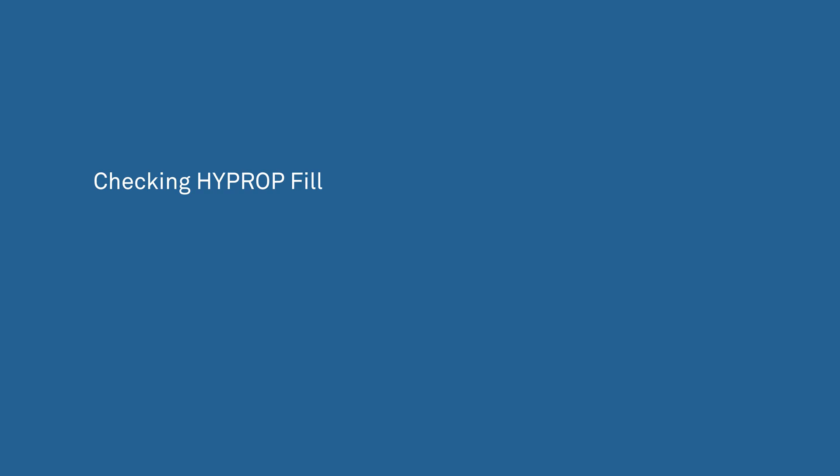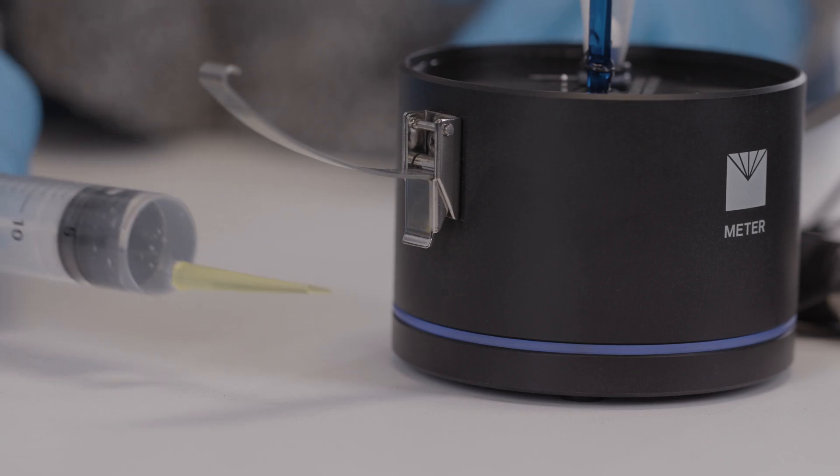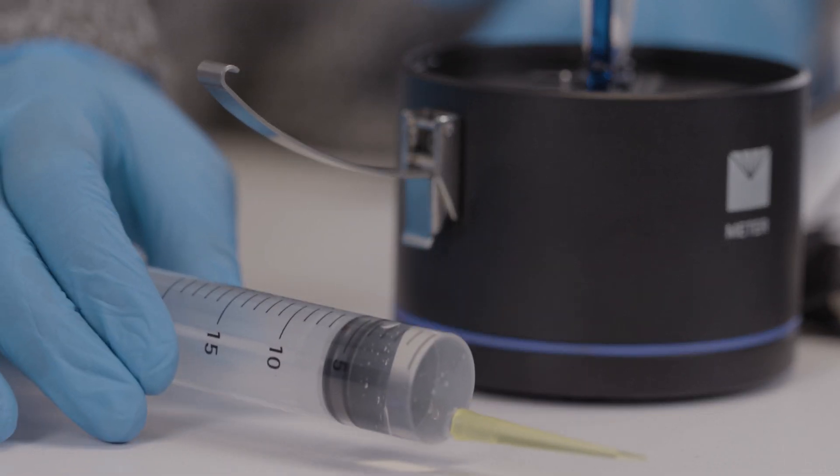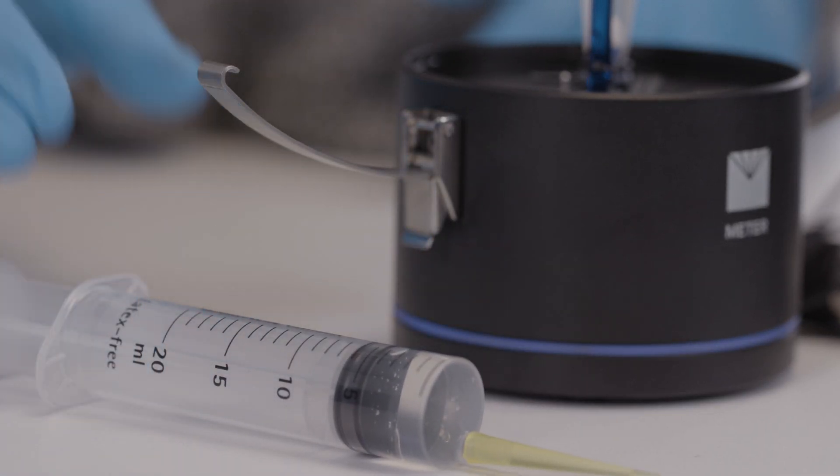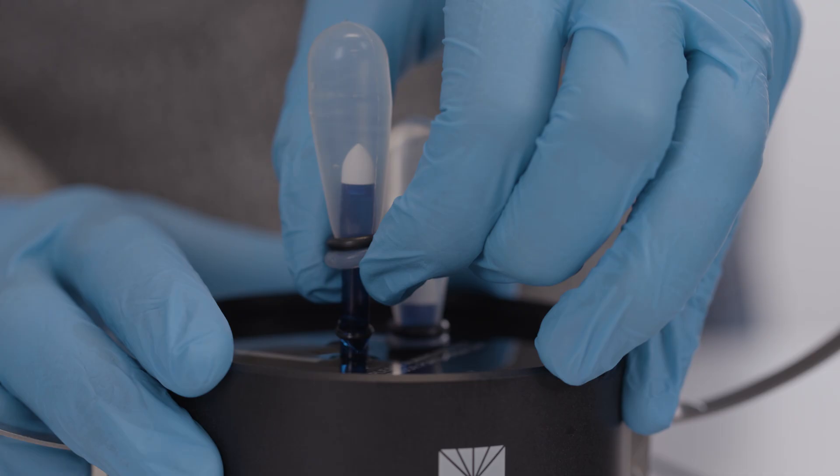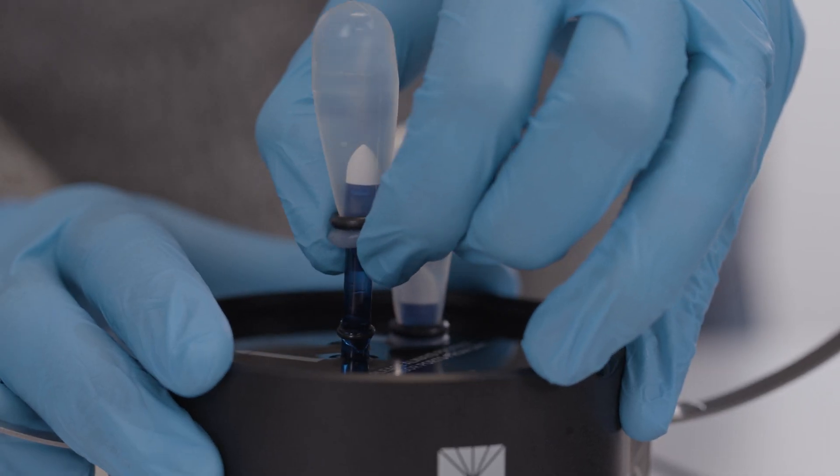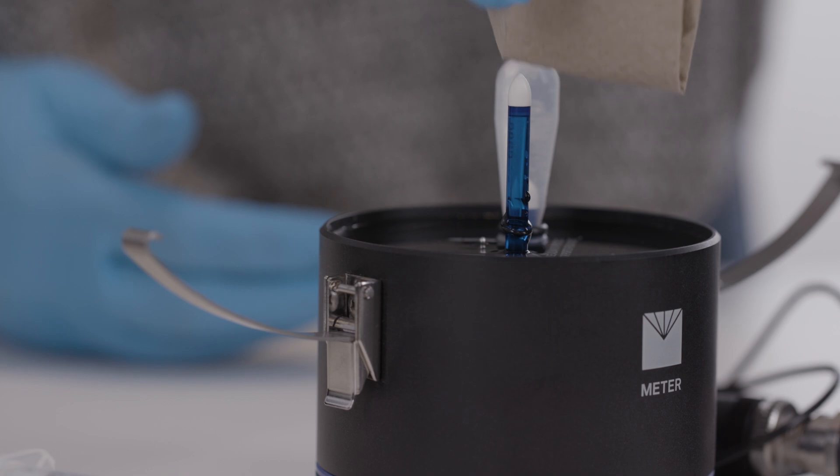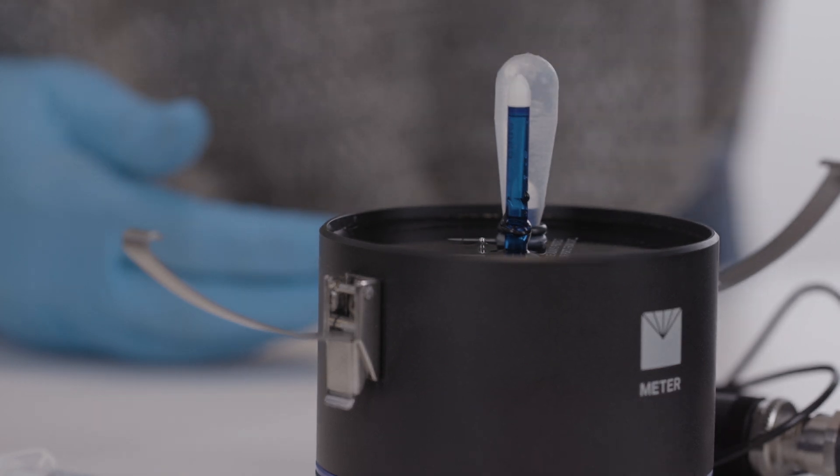The next step is to check the HyProp fill. To check the response speed, keep a syringe filled with deionized water on hand. Remove the silicone cap from the long tensio shaft and dry the ceramic tip with a paper towel. Use a paper towel and fan air over the ceramic.